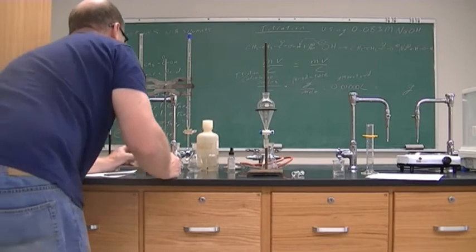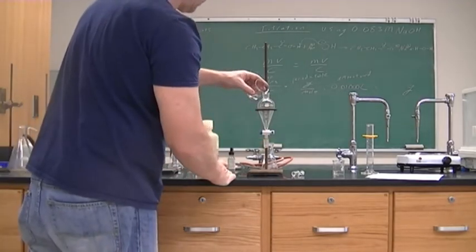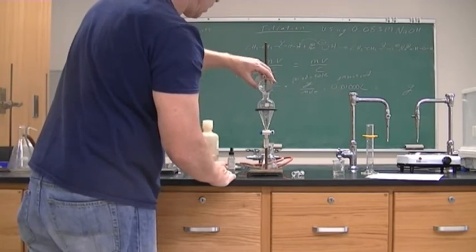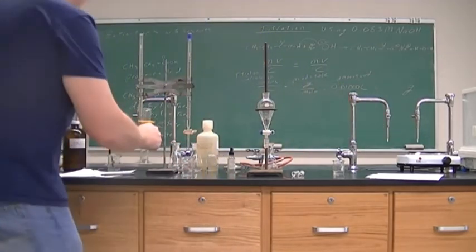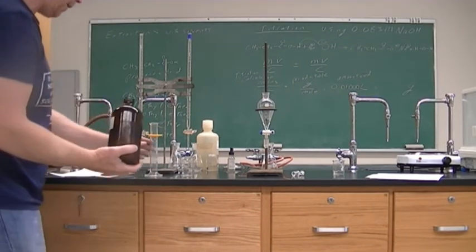Okay, there's our 10 mils of acid that we will put into our separatory funnel. Now this time with the ether, we're going to use 15 mils of ether, but we're going to use it 5 mils at a time.